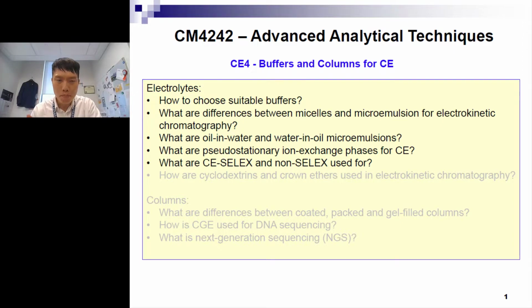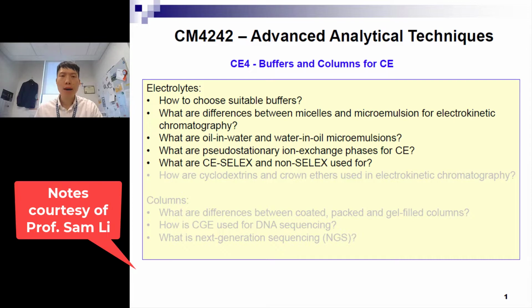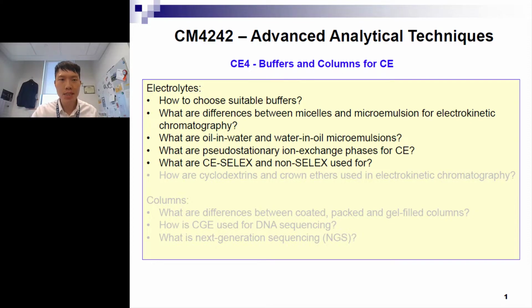Hi learners, welcome back. This is the last part of Capillary Electrophoresis, part 4 of this advanced analytical technique. Here we're talking about buffers and columns for CE.